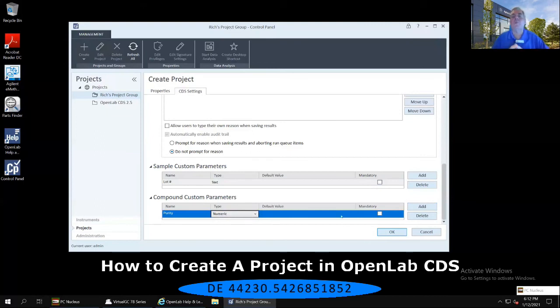I will explain what those things mean by going through a scenario that unfortunately, again, a very close friend of mine up in the Boston area got bitten by. She was setting up a 100 injection run to run over the weekend. What she did not realize is that her manager had gotten to her project and had created a sample custom parameter that he felt was absolutely necessary.